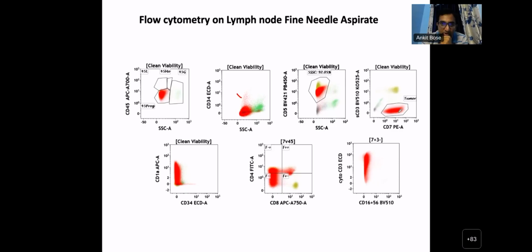CD7 is positive. Let's not say diminished and increased, let's say positive. What about CD1A? CD1A expression is positive. Very good. CD4 positive and a subset showing CD4 and CD8, right? You will agree, right? Yes. And cytoplasmic CD3 positive. So do you see the same phenotype that we saw in peripheral blood, or does this look anything different to you?